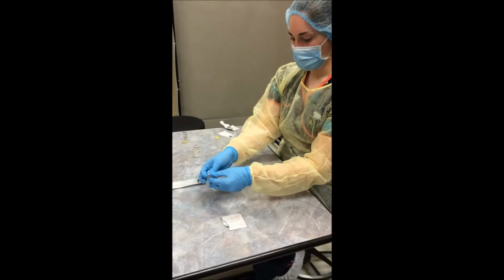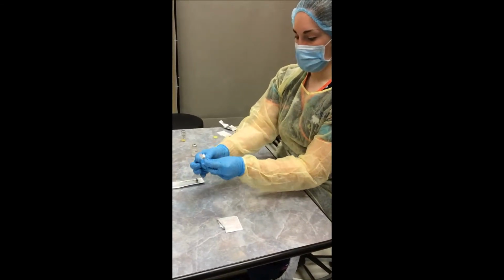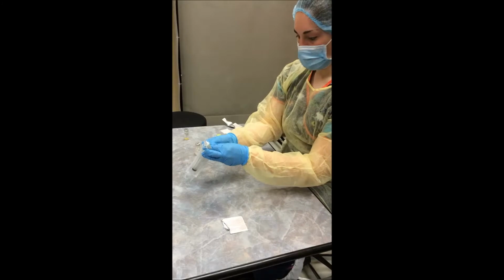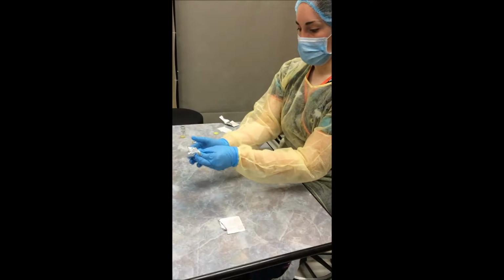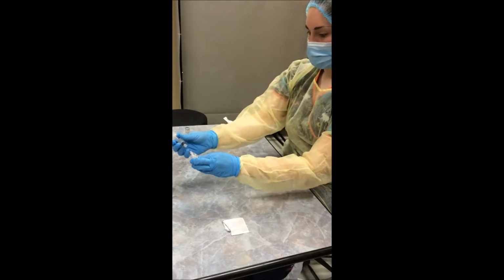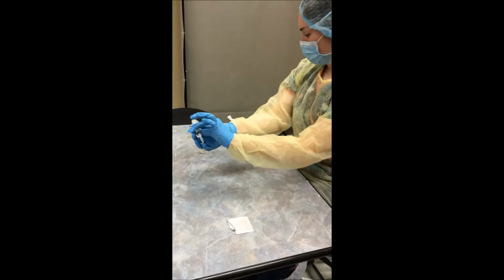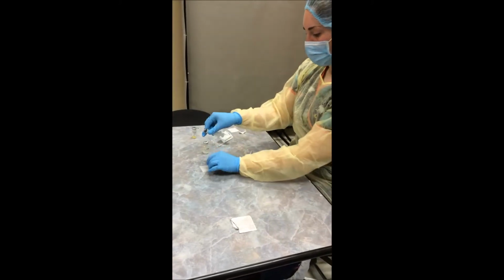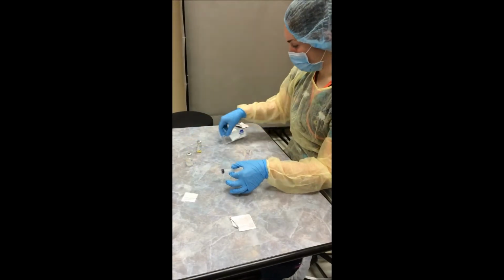Now we open our needle, making sure not to block the first air, and holding the tabs back so that they don't block it. And you can do the same for your syringe. And twist that on. You would take one of your alcohol swabs, pop that off, put this over here, and now we are all set to reconstitute.